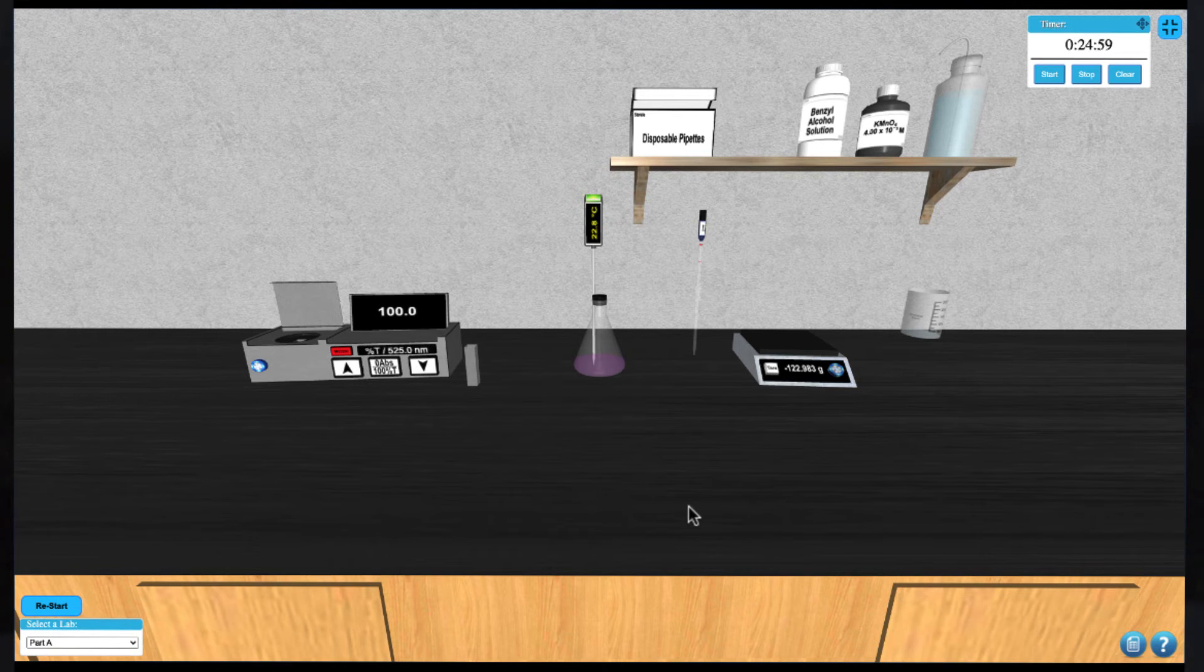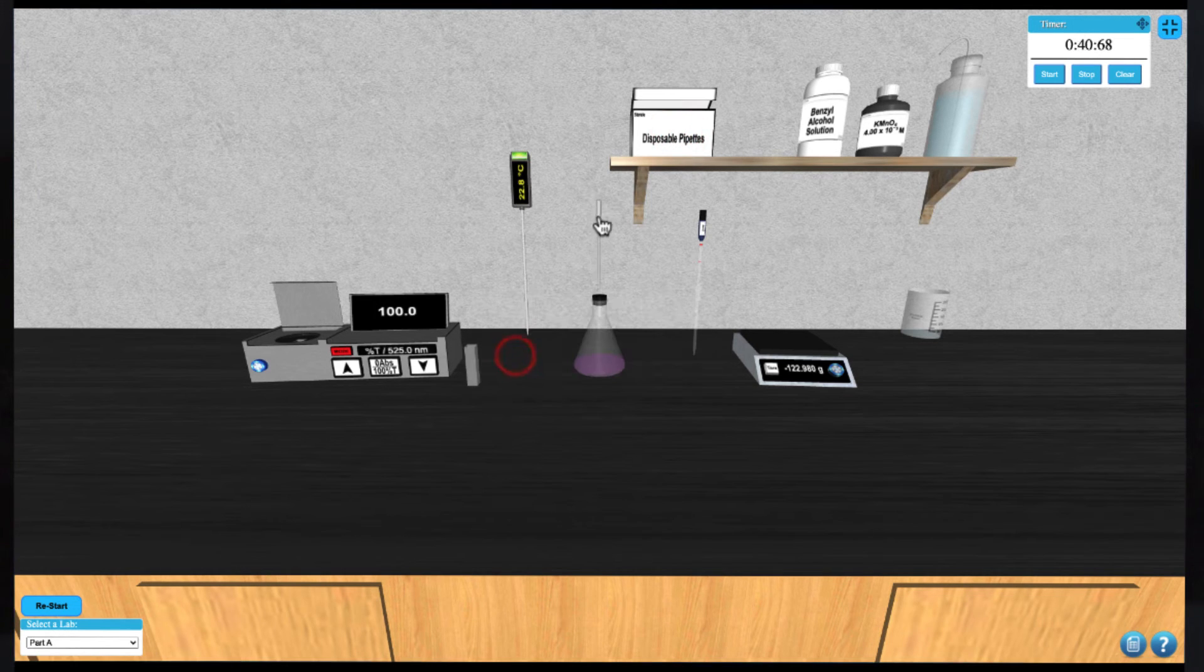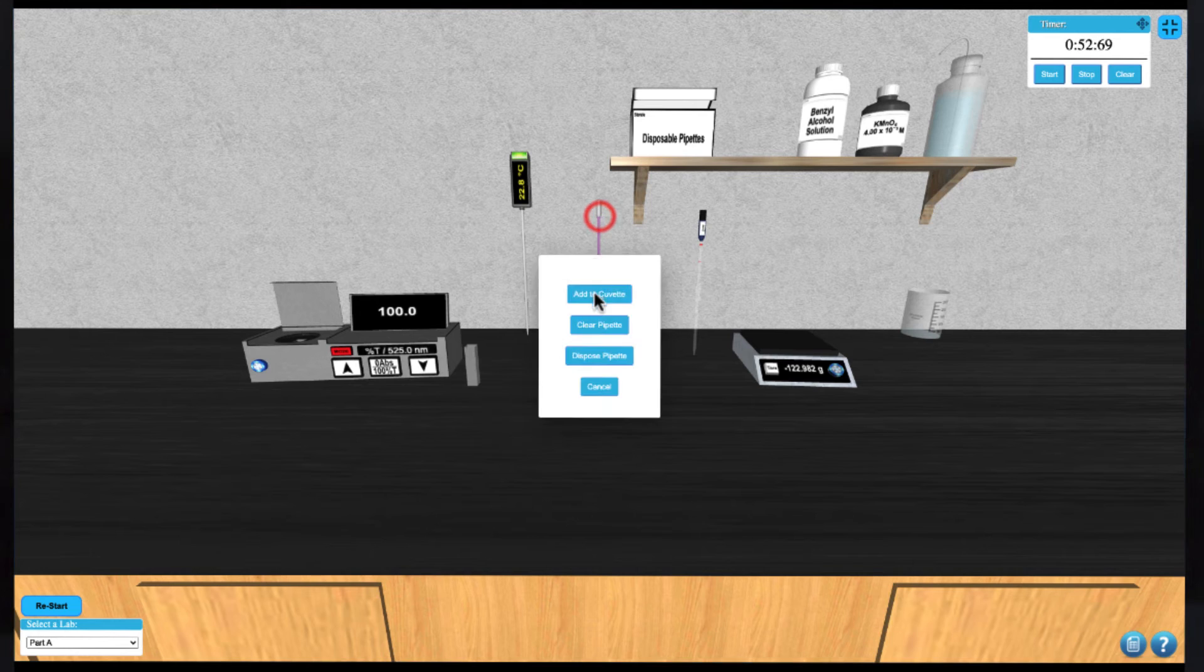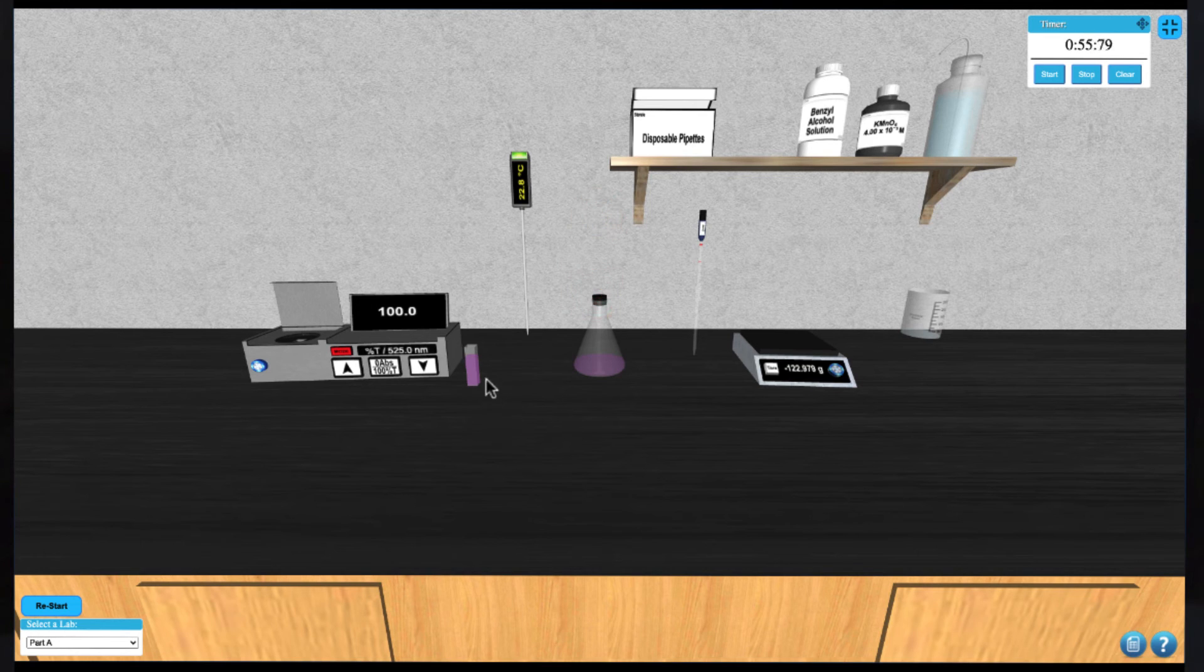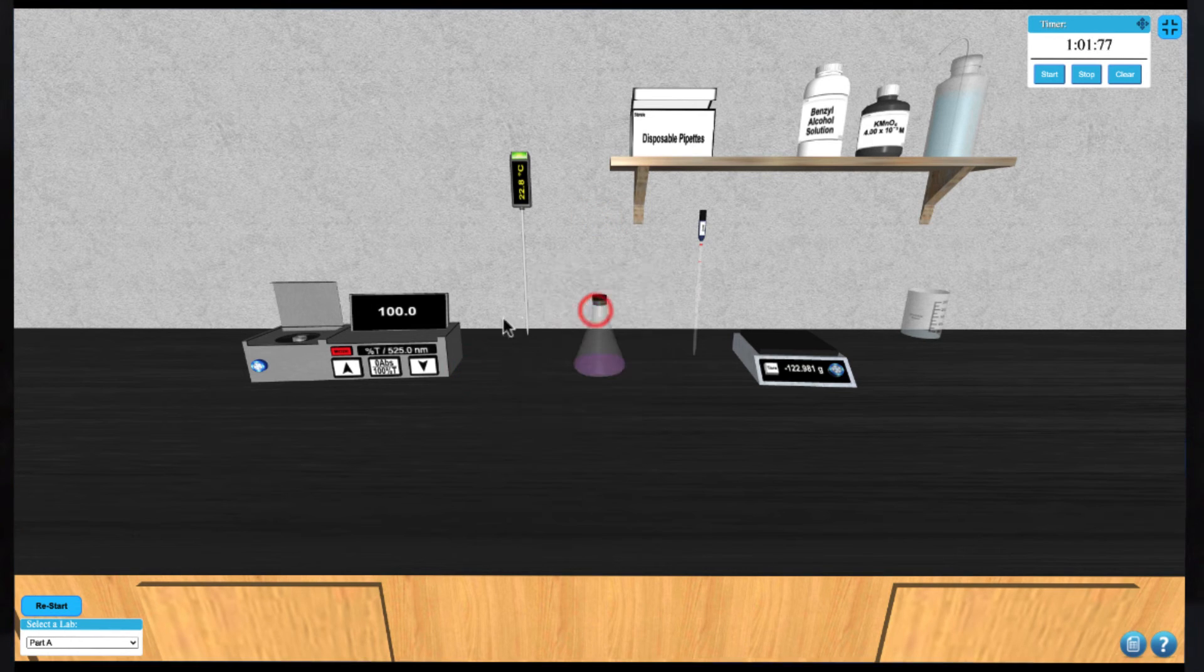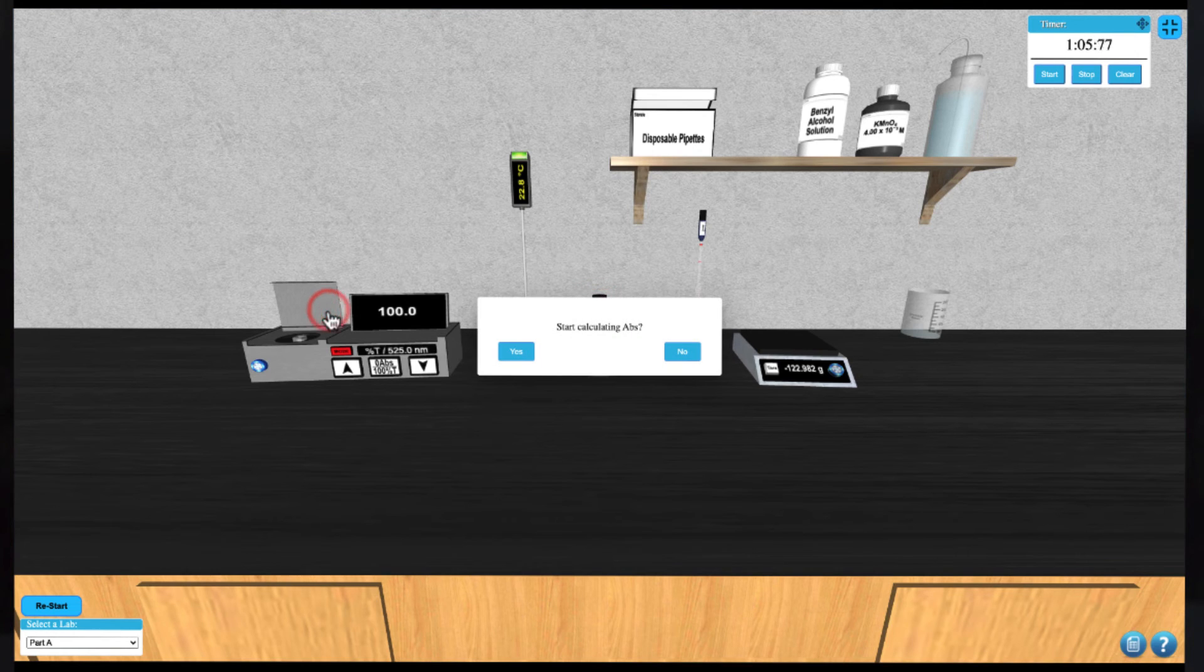Next you can click the disposable pipettes to load one. This will remove the thermometer from the flask. Draw up the solution and then add it to the cuvette. Click the cuvette again to add it to the spectrophotometer and close the lid to start taking measurements.